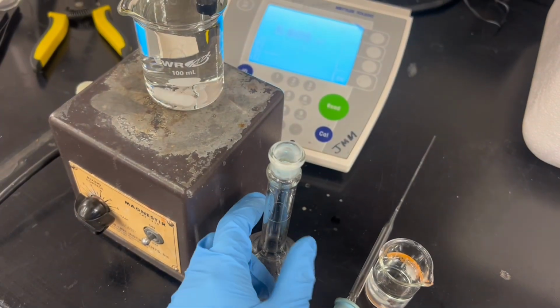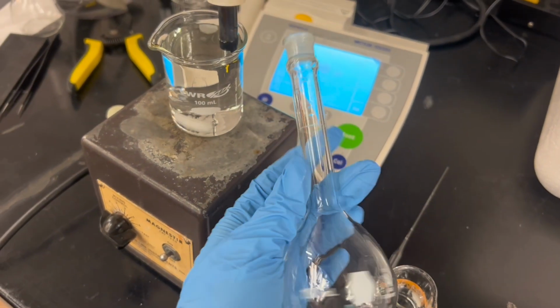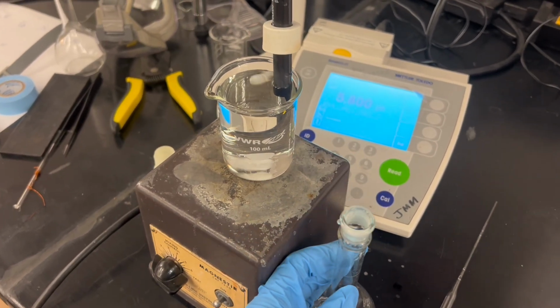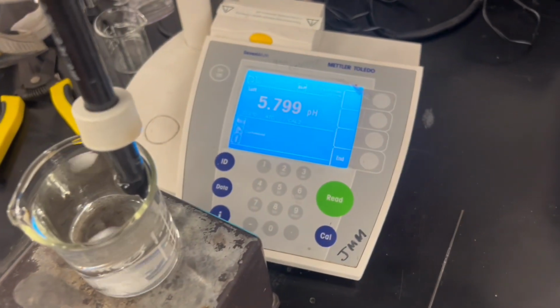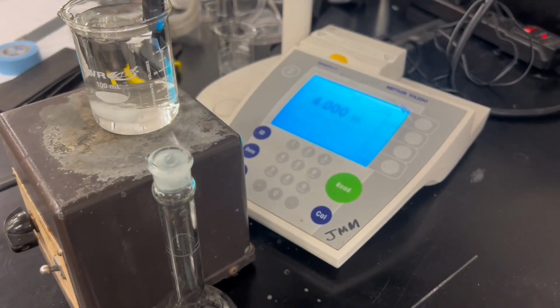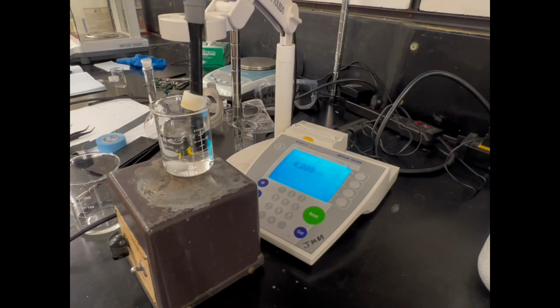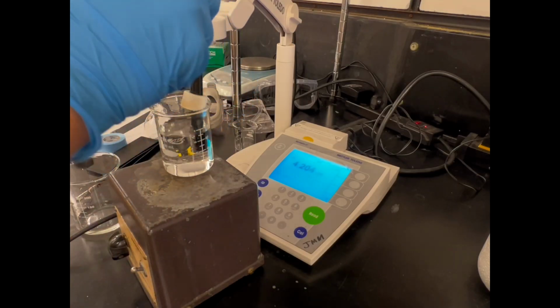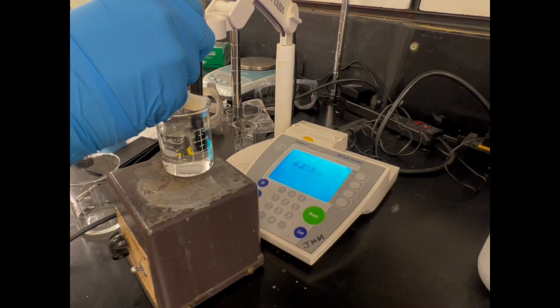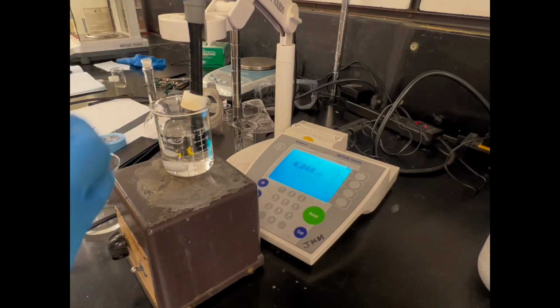Firstly, I would suggest we use a volumetric flask to measure the solvent first. Then we can know how much solvent we should use in order to make the solution, and that will make it easier and give higher accuracy.